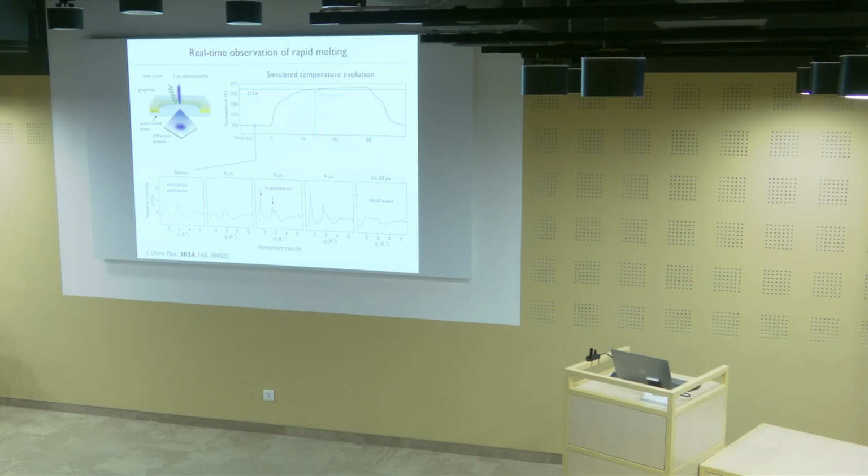And so I'm just showing the diffraction pattern here in the vicinity of the first 3 diffraction maxima of water. Right, and so then we switch on the laser beam, the temperature starts to shoot up, and then at 136 Kelvin, we cross the glass transition temperature of water. So above this temperature, water turns into a supercool liquid, right?